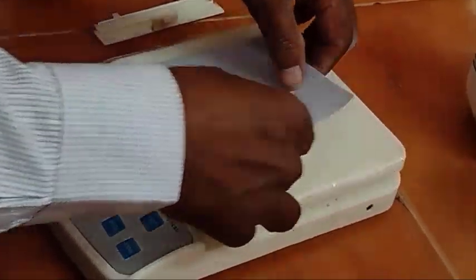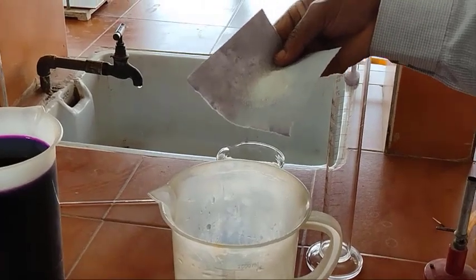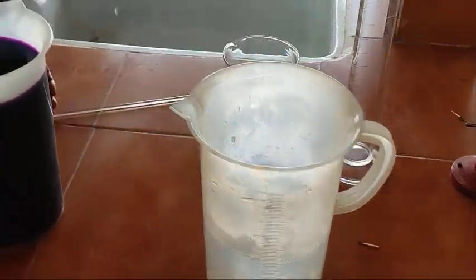So you take this substance and dissolve it. Okay, this is 1 liter. Now dissolve it and of course stir it. Now take the weight of the empty paper.